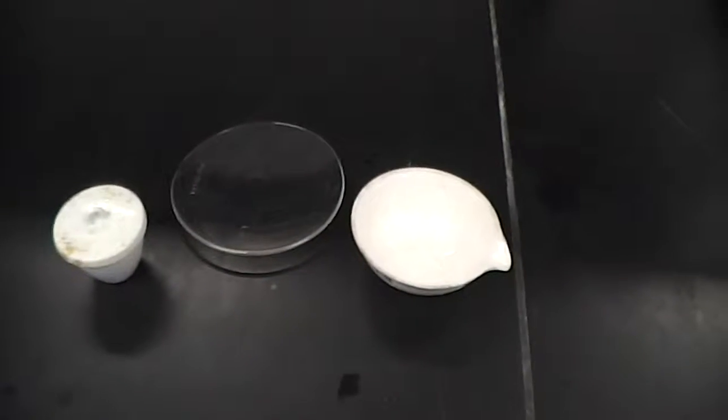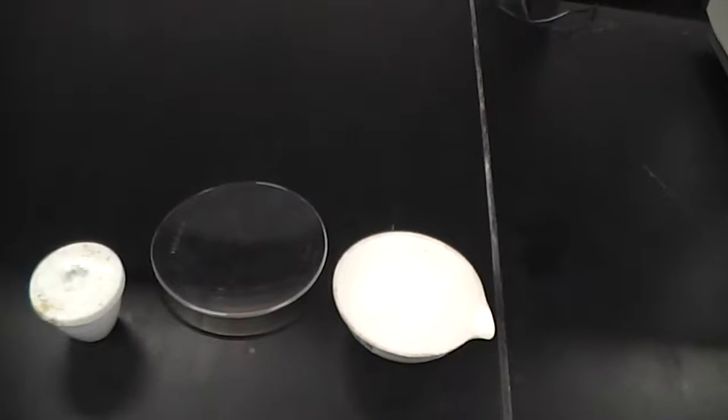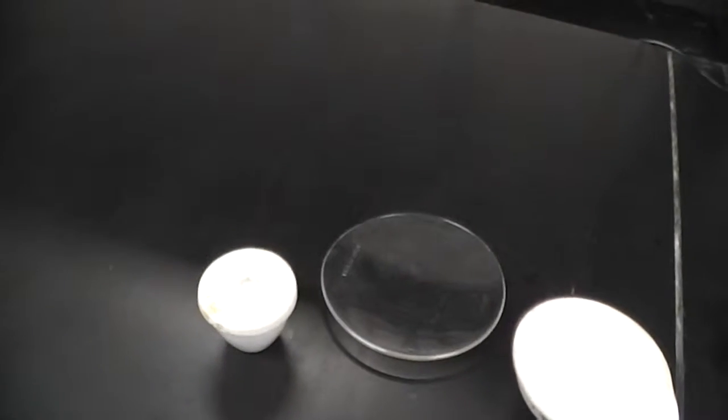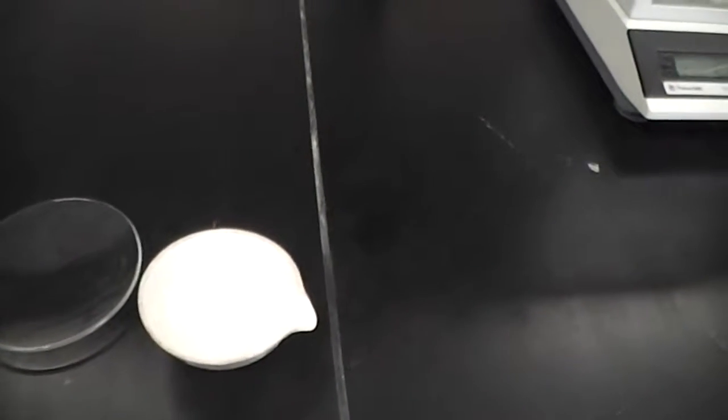Three different pieces of equipment that look very similar on paper but very different in the laboratory are the crucible, the watch glass, and the evaporating dish.